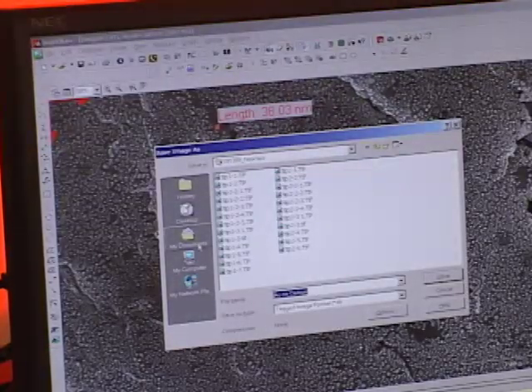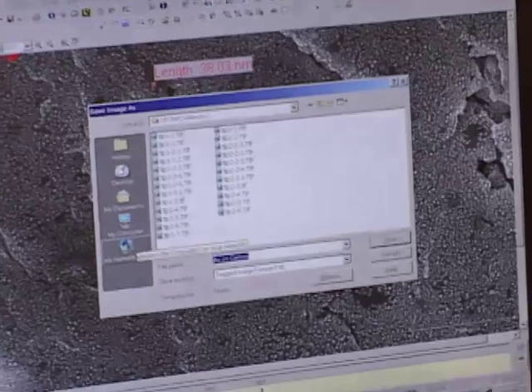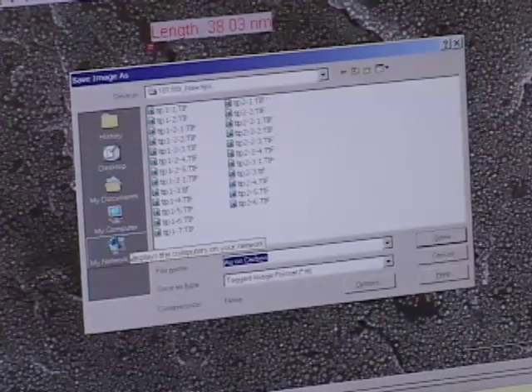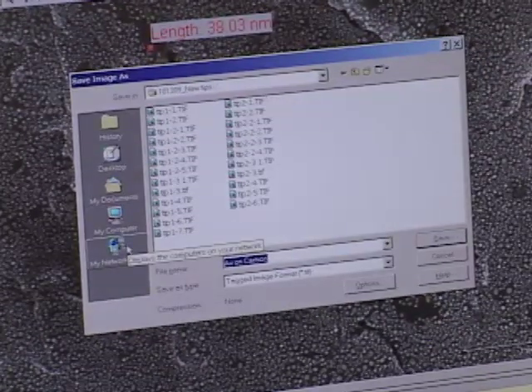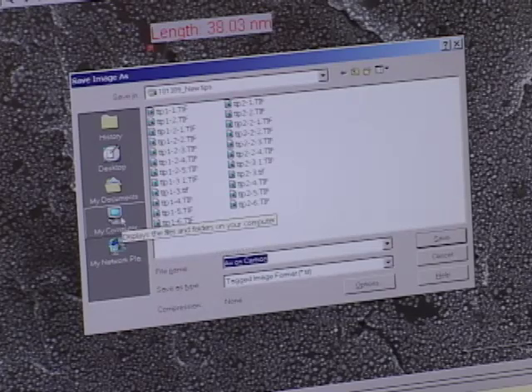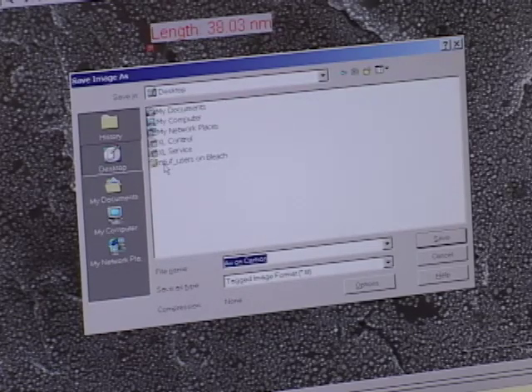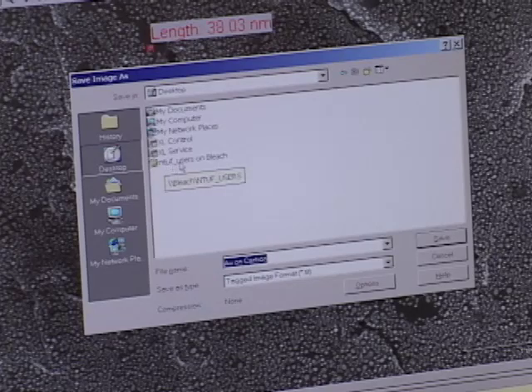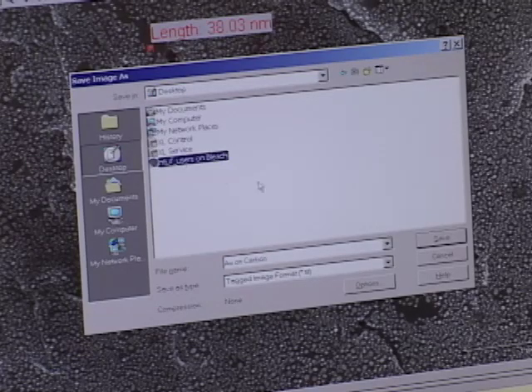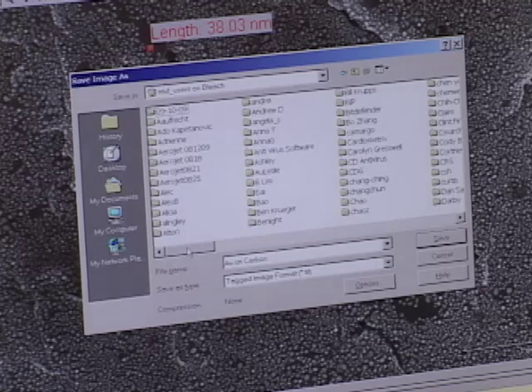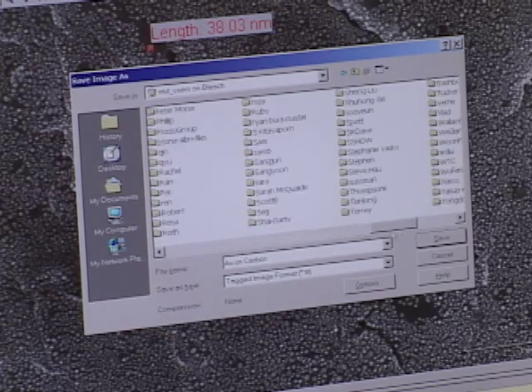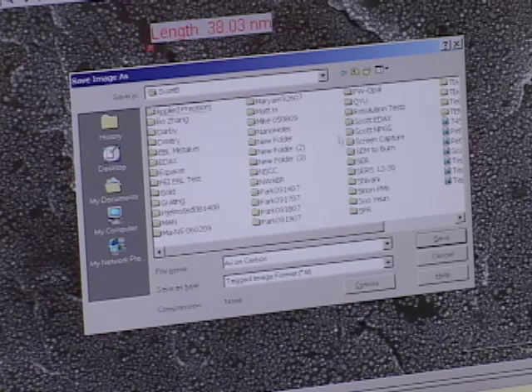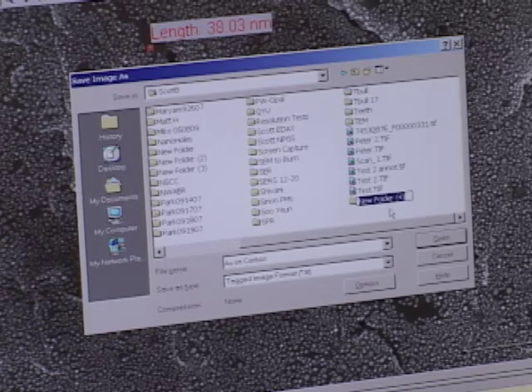We have a network drive where we save all of the images. To access that network drive I'm going to go to the desktop link. The drive is called NTUF users on bleach. I open this network drive and see there are folders for each user, so I'm going to find my own folder, open it, and within my folder I'm going to create a new folder with today's date to keep my images organized.